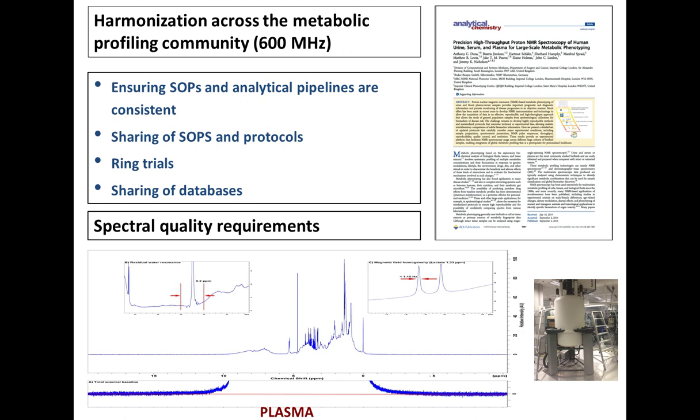So what we're aiming to do in the metabolic profiling community is to achieve harmonization. And whilst this is very difficult, for NMR we've almost got there. So just reiterating, we need to ensure SOPs and analytical pipelines are consistent. And we do this by sharing of SOPs and protocols and ring trials, one of which Manfred touched on briefly and I'll come back to, but also sharing of databases.